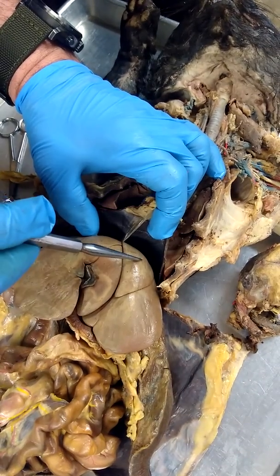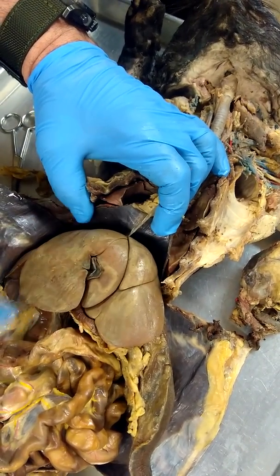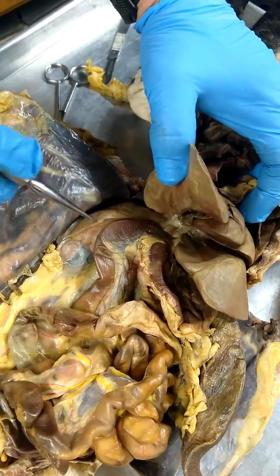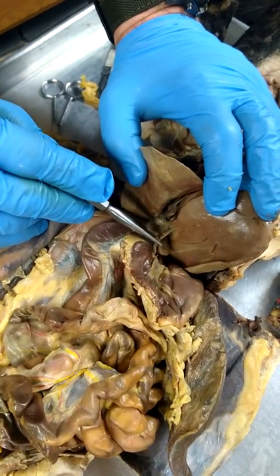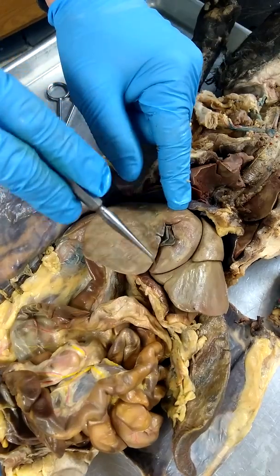So on this side we have left medial lobe, left lateral lobe. This is all right medial lobe. And then both of these are part of the right lateral lobe. The video or the CD has that wrong. These are right lateral lobe. And then one other lobe down here, this little part that sticks out here, that's called the caudate lobe of the liver.